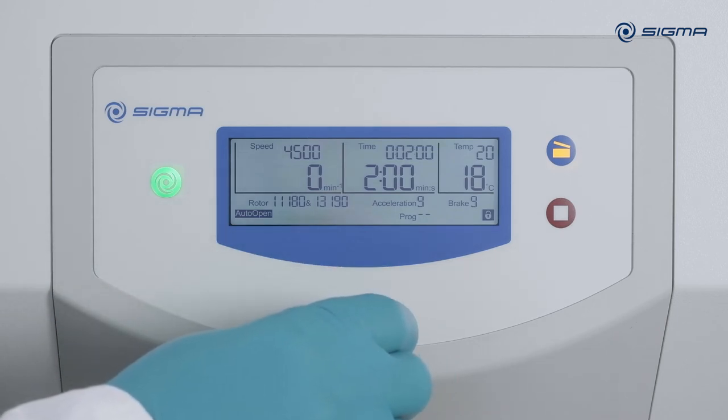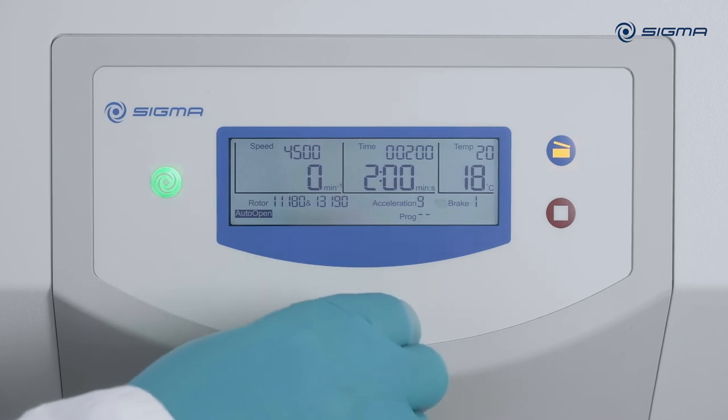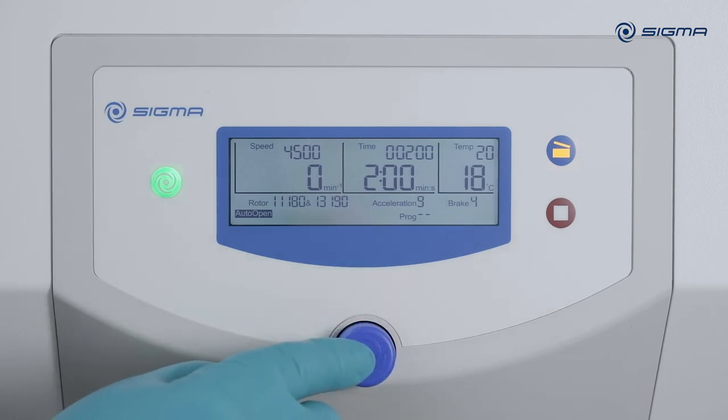To set the braking curve, turn the knob eight clicks to the right. After you press the knob, make the setting and confirm it, the new braking curve will be accepted. Number nine is the strongest braking, while zero is free run out.